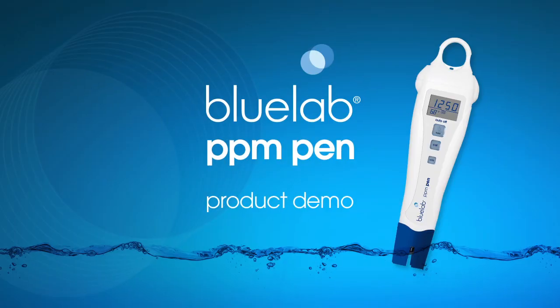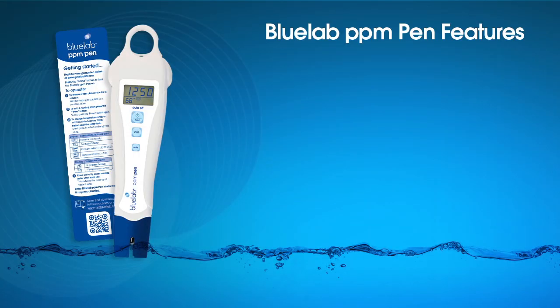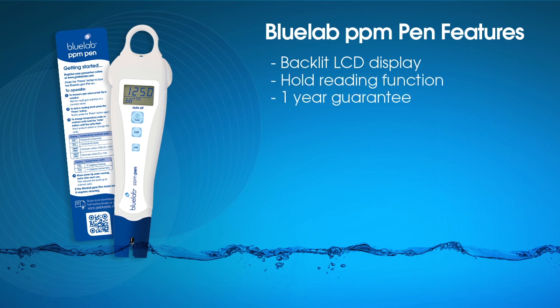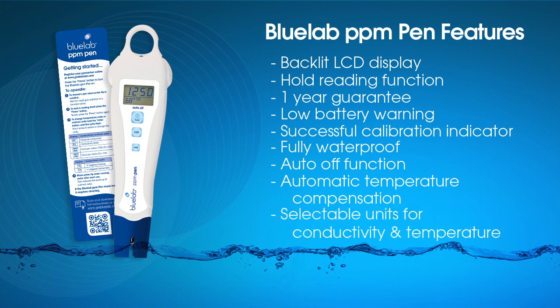We at Bluelab hope you enjoy your PPM pen. Some of the features of your pen are: backlit LCD display, hold reading function, one-year guarantee from date of purchase, low battery warning, successful calibration indicator, waterproof, auto-off function, auto temperature compensation, and selectable units for conductivity and temperature.